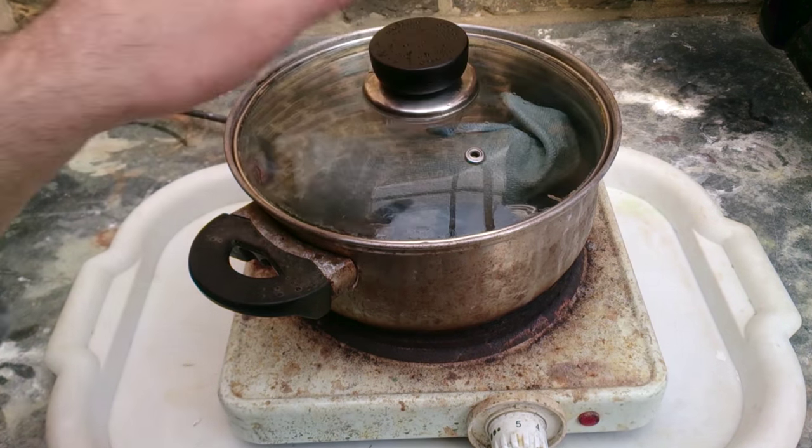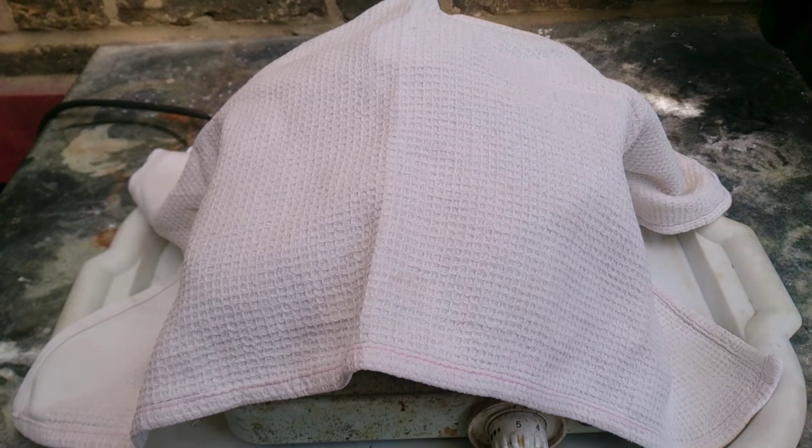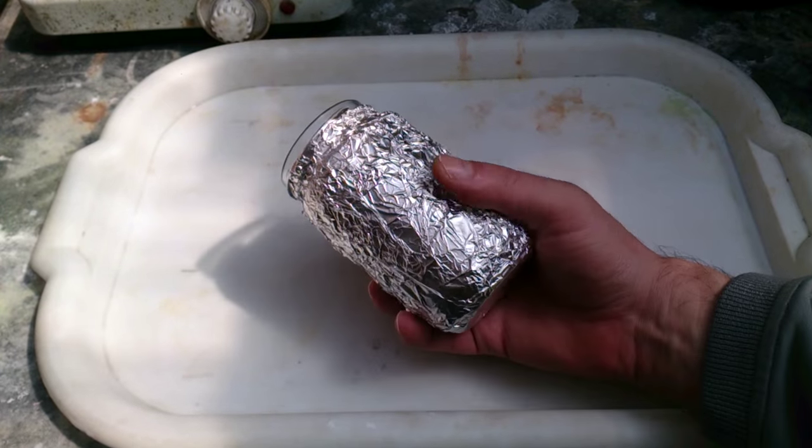Now there's an important part. When you finish boiling, cover your pot with kitchen towels so it will be cooling down not rapidly but as slowly as possible. We've made the glass jar just a little bit more fit for purpose, but it's still not good enough.